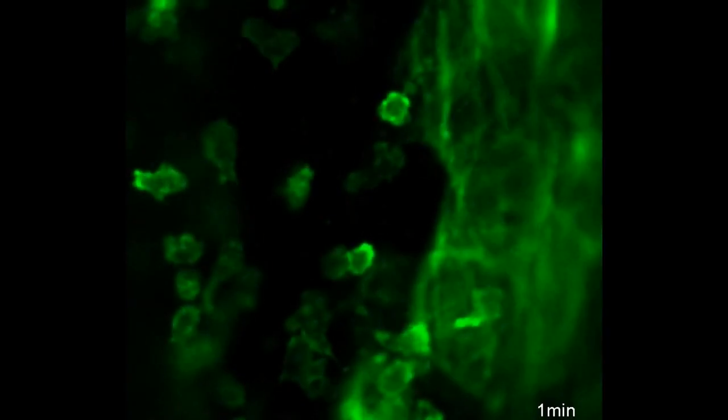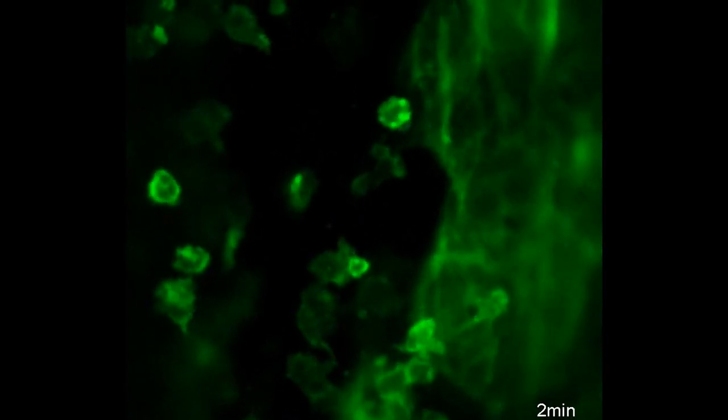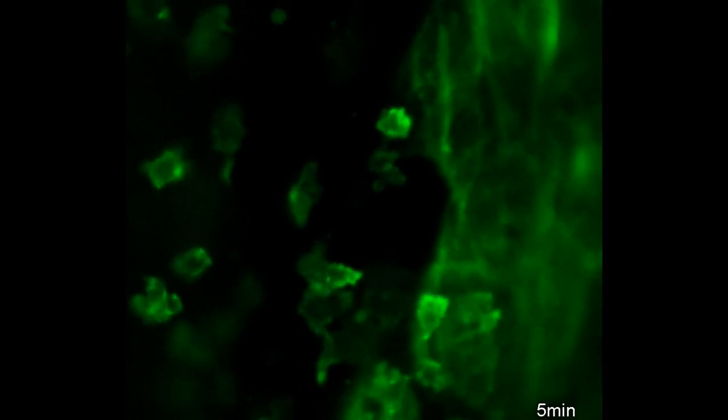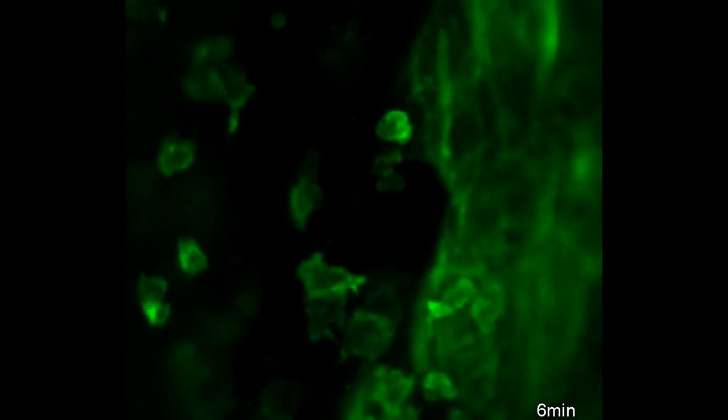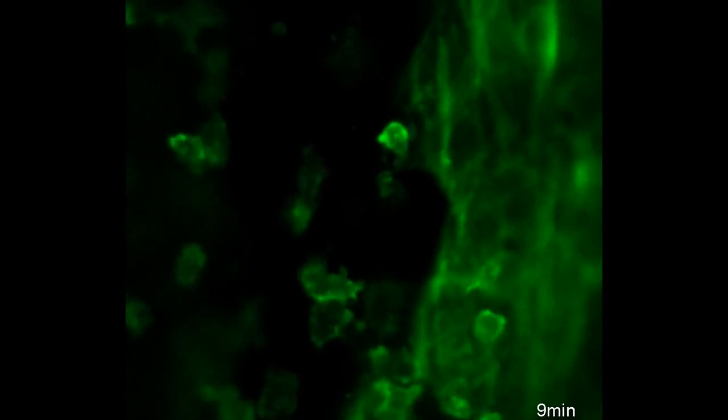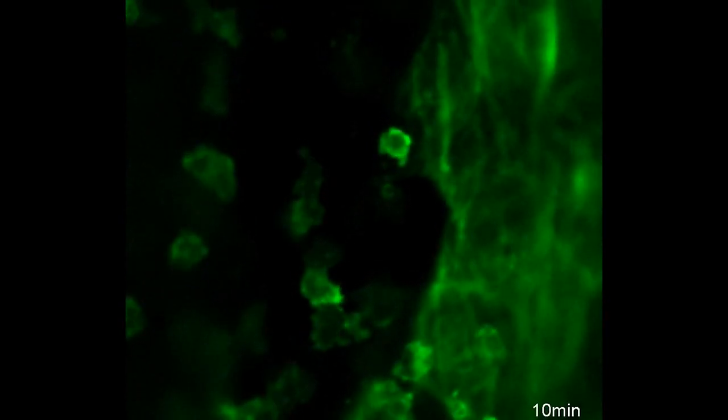Or during wound healing. These are neutrophils in a mouse that express a marker for the actin filaments and that crawl inside a wound to help repair the injured skin. The membranes of these cells are constantly remodeled as the cells move.